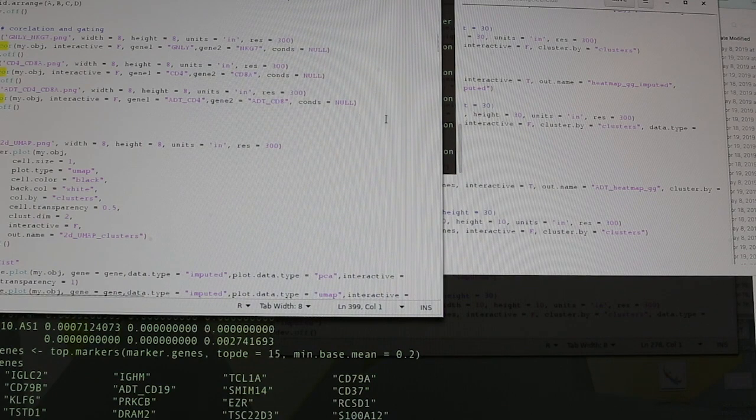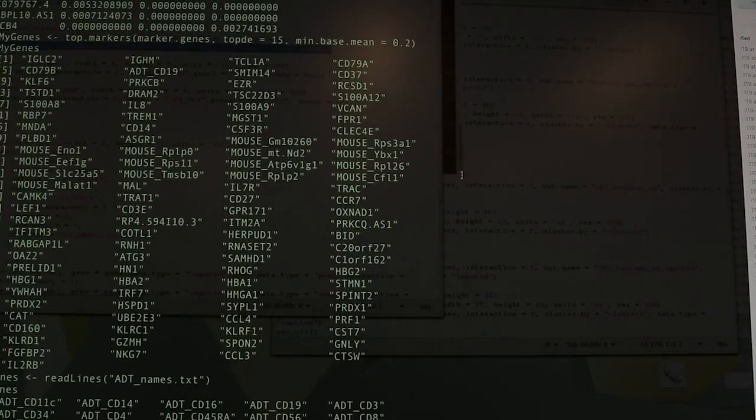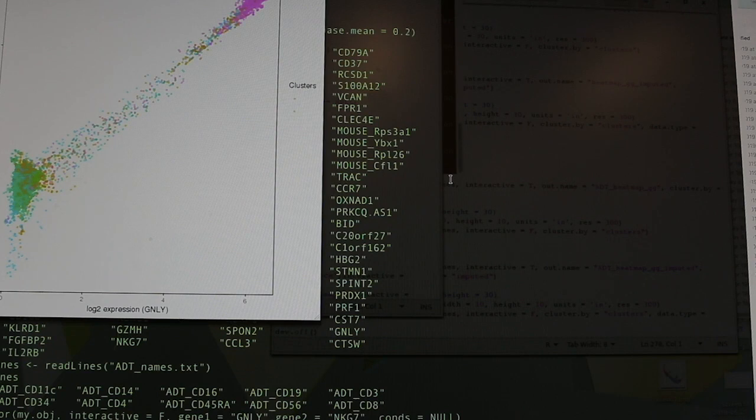Now, if you want to study the side of the cluster that's low versus the side that's high, you'd have to come up with parameters that would split that cluster first, and then you can compare them more easily to do differential gene expression or something like that. With manual gating, you can really just draw two circles, right? And now you can compare those two poles of the same cluster in one step. It speeds things up.